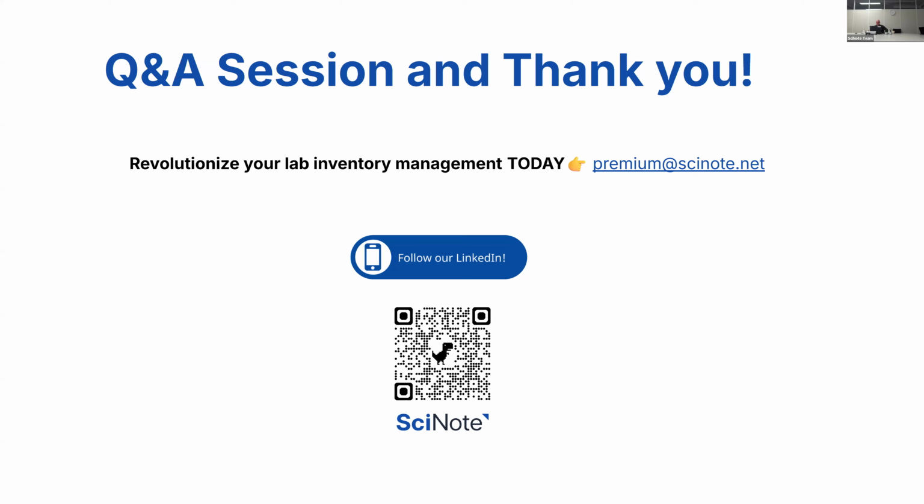Okay, let's see. I'm going to jump to Sarah's question because she had this much earlier than anyone else. They use SciNote on tablets in the lab. Can we use the camera on the tablet to scan a barcode and link the reagent material directly in the form or protocol? Yes. The last time I tried this, I tried it with a phone, not with a tablet, but you can actually scan it with any barcode software on your phone, and it's going to filter out. So when you're on the task and assigning the item, it's going to filter out that one, and you can quickly assign it. So yeah, you should be able to do that.